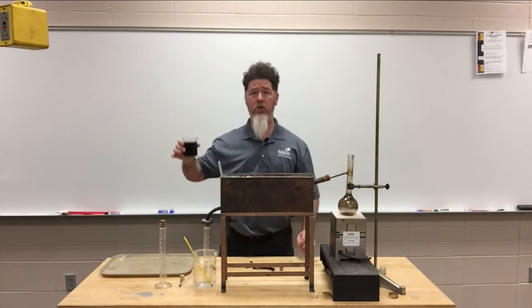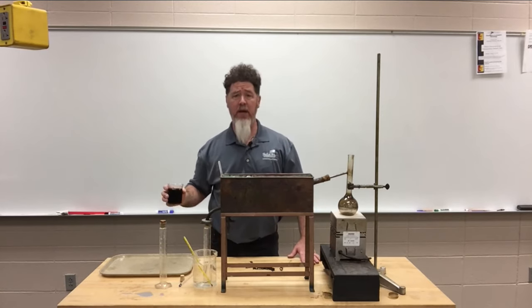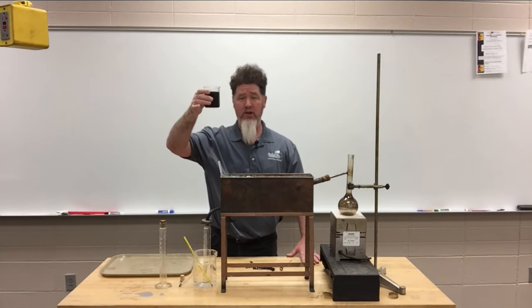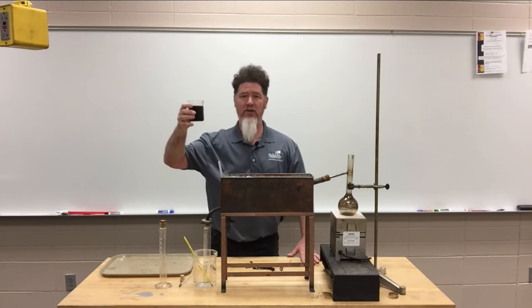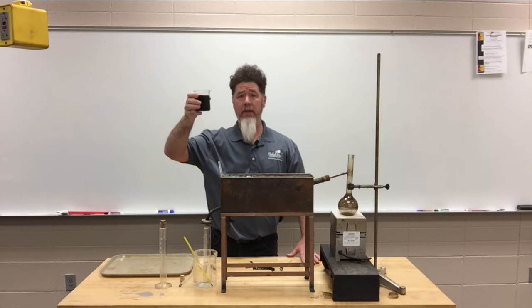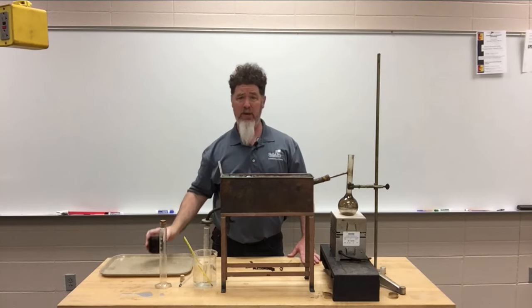And so we do this lesson as a simple way to explain how distillation works and how from crude oil you can separate out the different fractions to make gasoline or kerosene or jet fuel or diesel fuel or really whatever you want to. We're going to try to make some straight run gasoline and some diesel fuel.